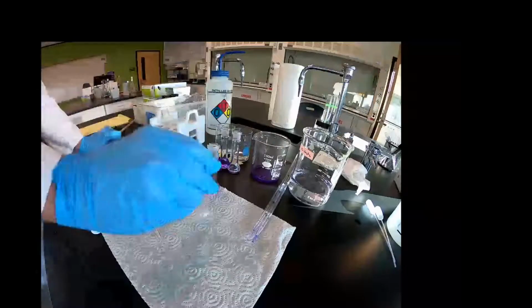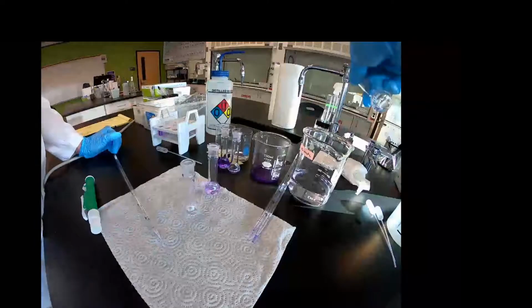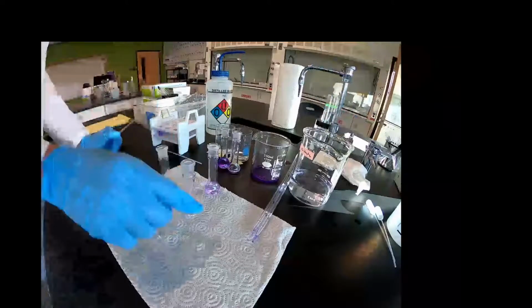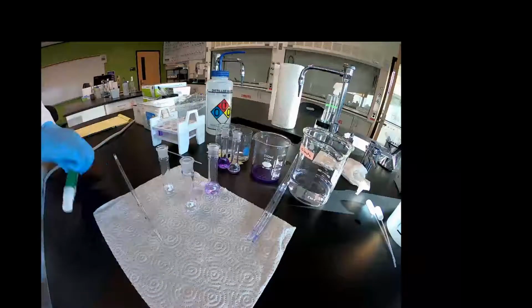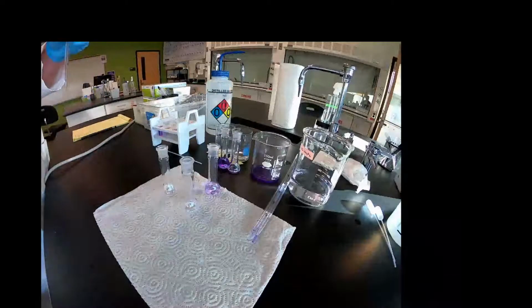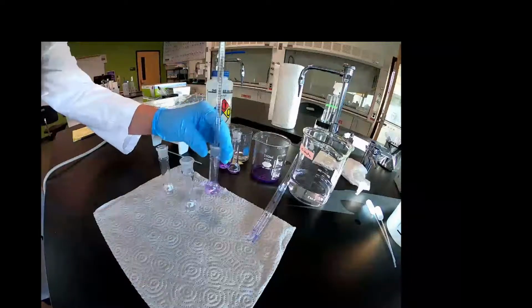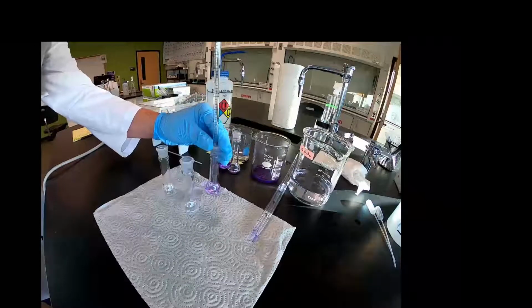That's good. That's proper technique. Actually, that's not proper technique, because again, it's a dilution going on in there. So if I'm about to dilute in it, I rinse it with water, because that's what I'm going to add to it anyway. When you do it that way, you're adding a little bit of the sample, and so it's those drops that are left in there, they're going to change the volume that's being added right now.